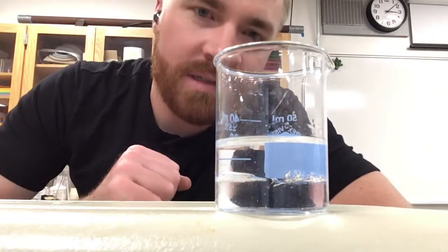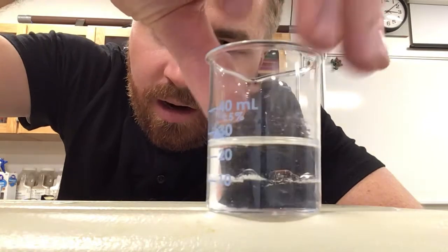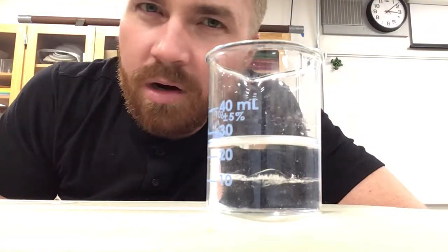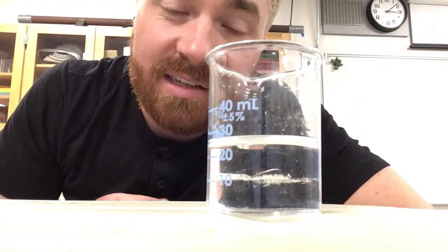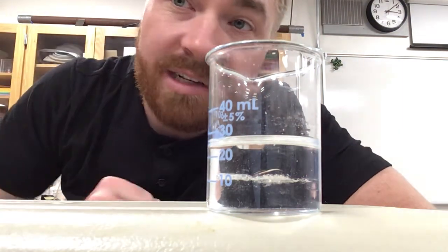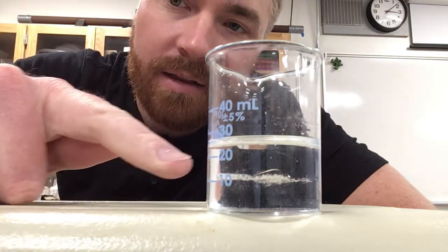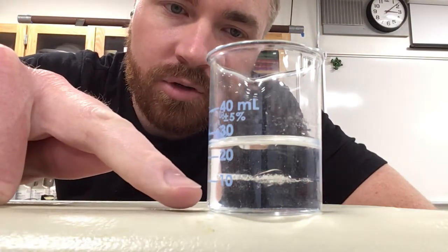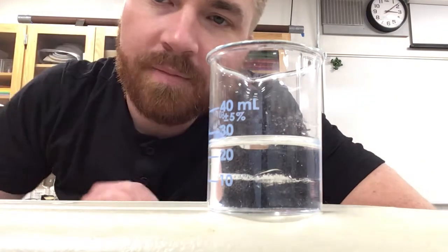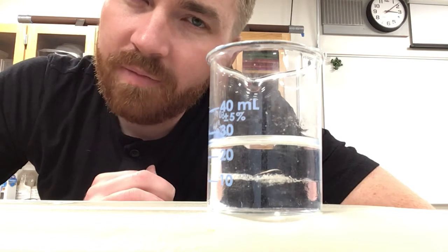All right, so now if we look at this, we can see that our ice is no longer on the bottom of the container. It started to float here in the middle. So you need to draw a picture of that for slide 3 of the ice there in the middle with a layer of solution below it and above it. You also need to explain why you think that ice is floating.